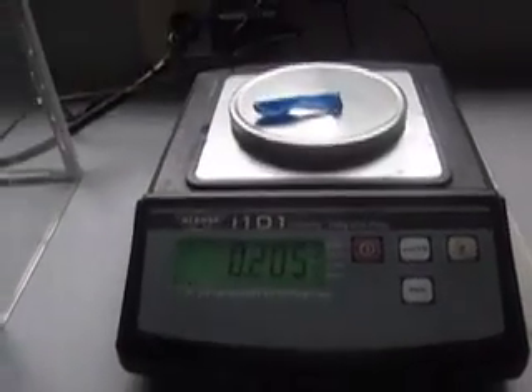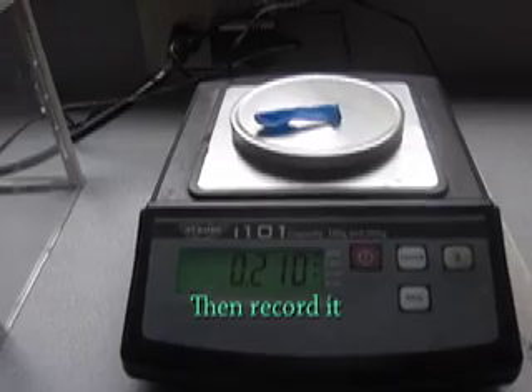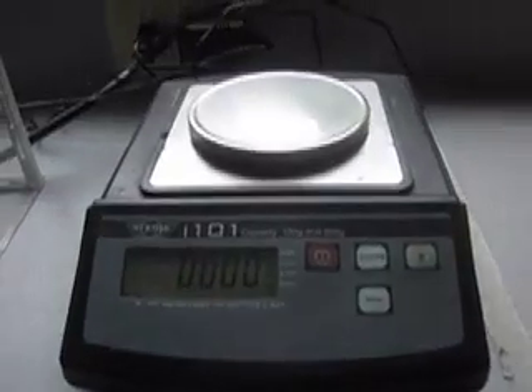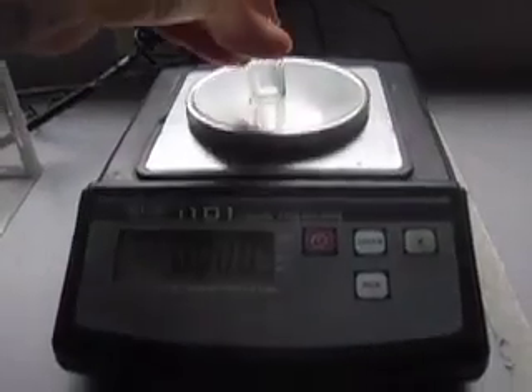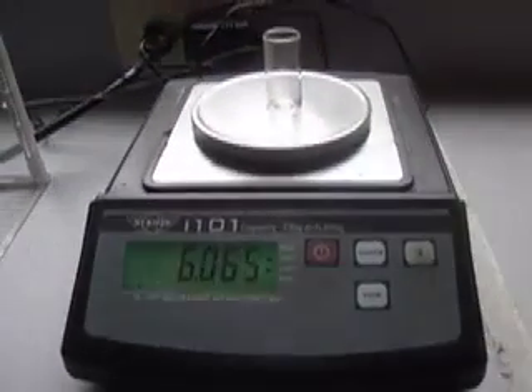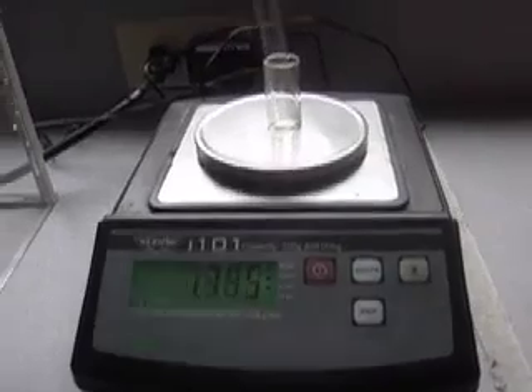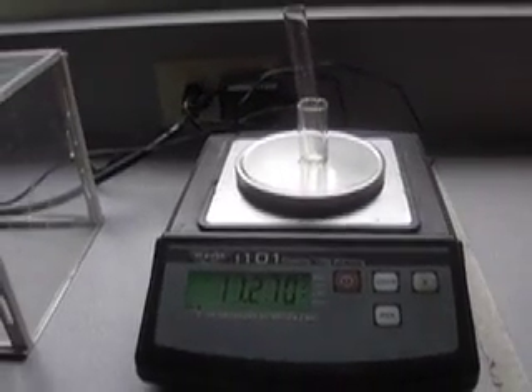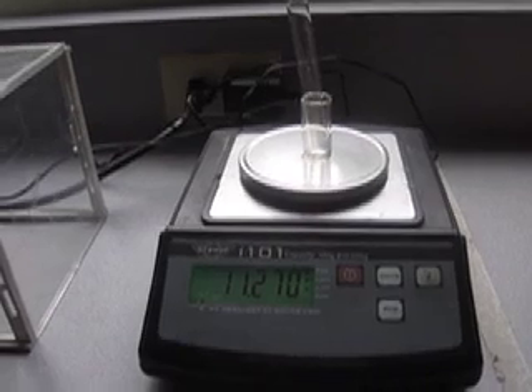So we will weigh the first balloon, which is 0.210 grams. Now we will weigh this fancy test tube holder plus the test tube, and that is 11.270 grams.